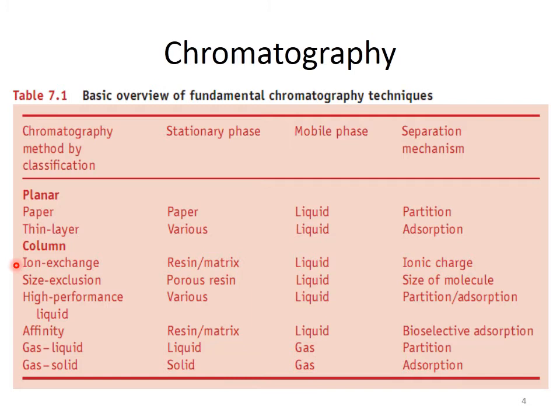One such example is ion exchange chromatography, in which the stationary phase contains charges on it, and the molecules, based upon their charge, are able to interact with the stationary phase, and hence separation is based upon charges. If the charge of the stationary phase and the molecules to be separated is the same, then they cannot bind to the stationary phase because of charge-charge repulsion. However, if the charges are opposite, then the molecules of interest can bind to the stationary phase. So ion exchange chromatography is based upon the charge of molecules.